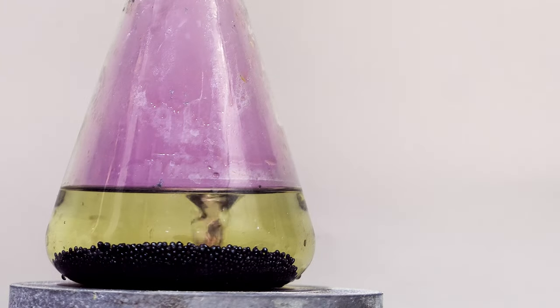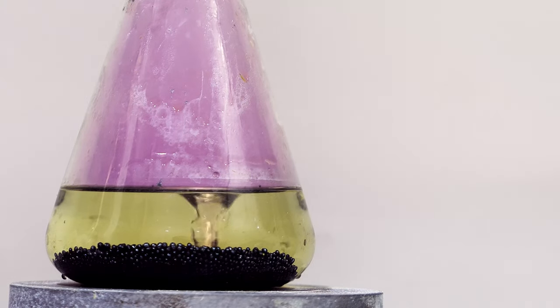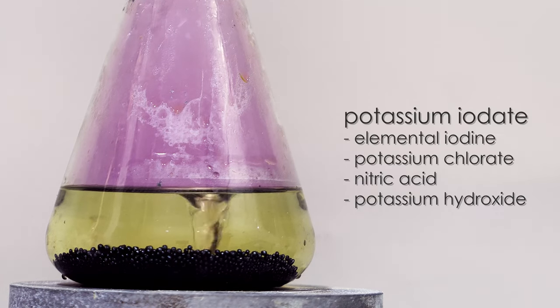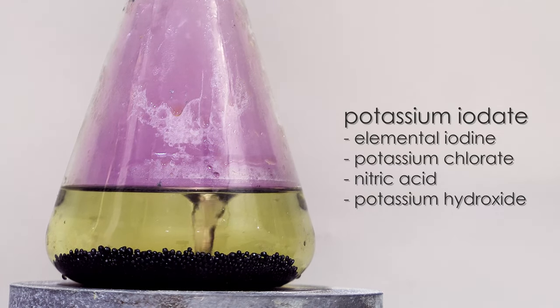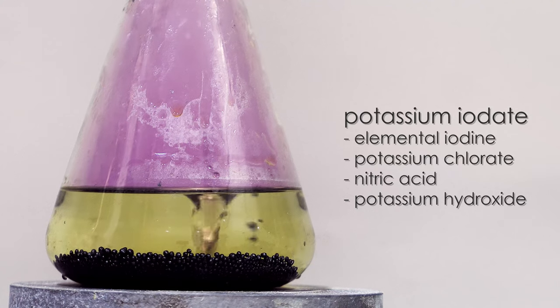In terms of chemicals, there are only a few chemicals needed. For making potassium iodate, we have elemental iodine, potassium chlorate, nitric acid, and potassium hydroxide.